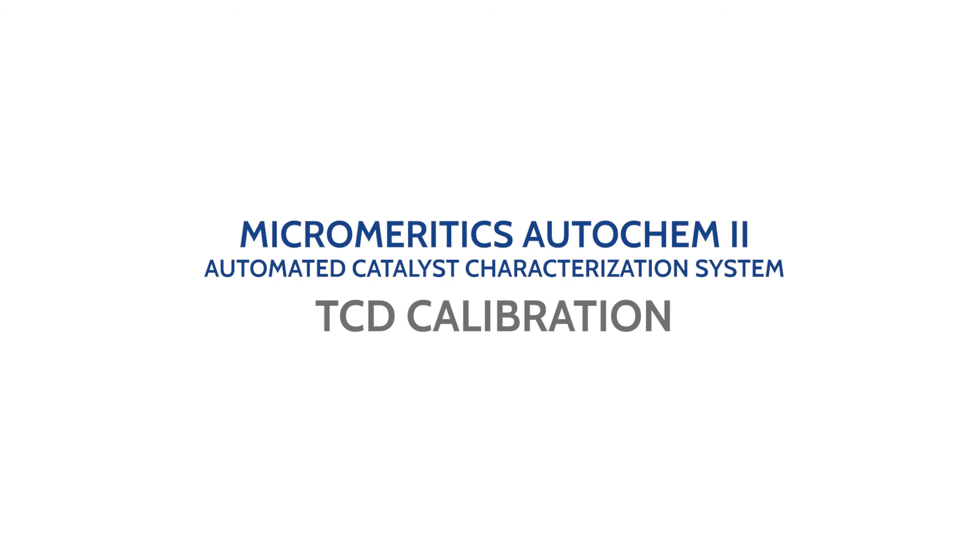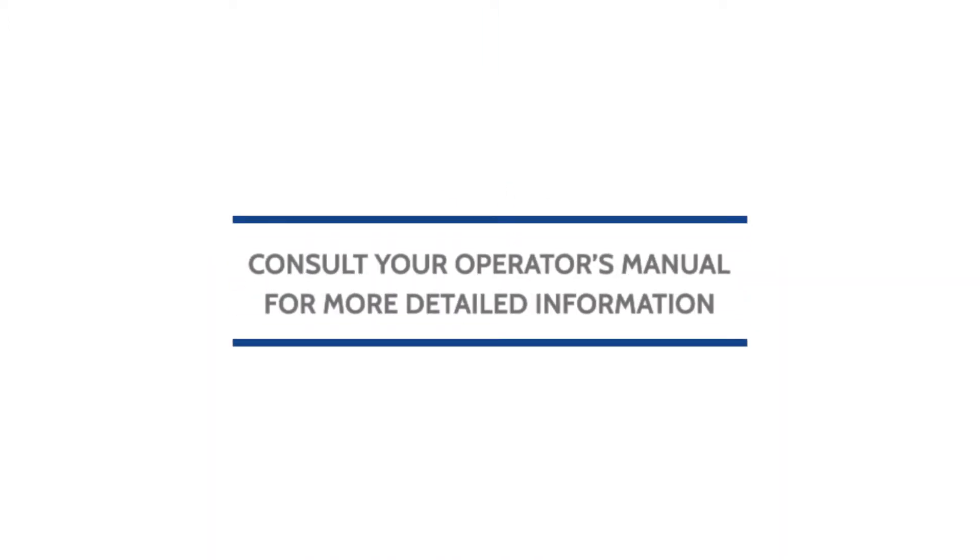This video will show you how to perform a TCD calibration on the Micromeritics AutoChem 2 Automated Catalyst Characterization System. Remember to always consult your operator's manual for more detailed information.